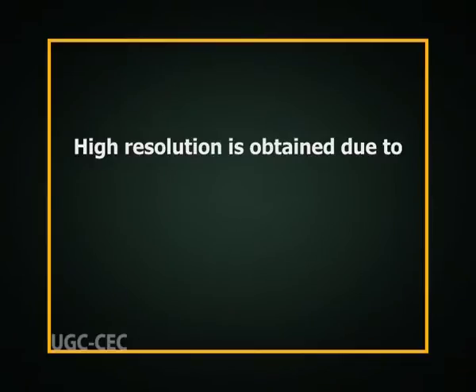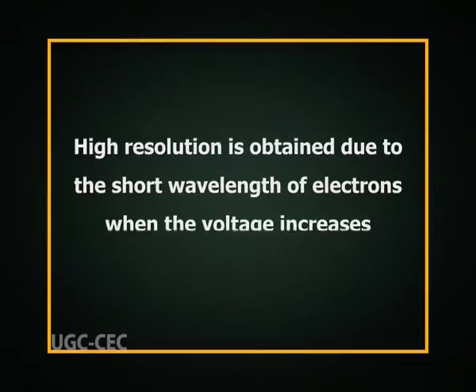High resolution is obtained due to the short wavelength of the electrons when the voltage increases. However, increasing acceleration voltage leads to poorer contrast since scattering of electrons is decreased at the higher velocity. In TEM investigations of colloidal systems, voltages between 80 and 200 kilovolts are usually employed.